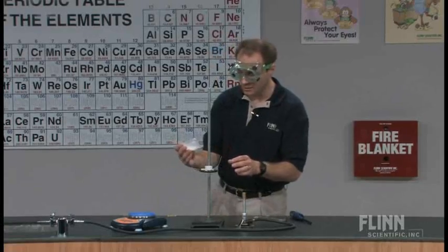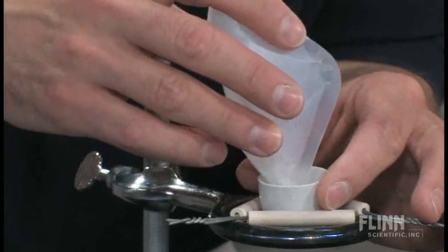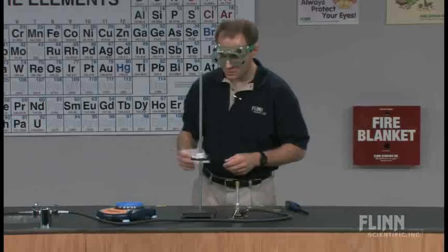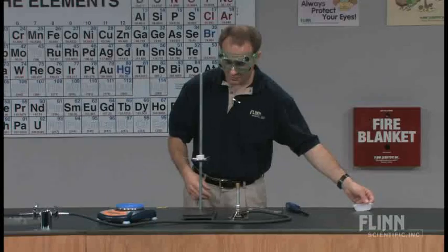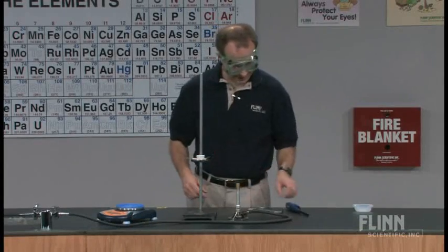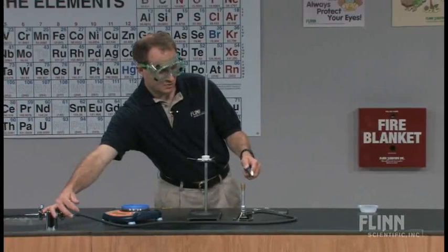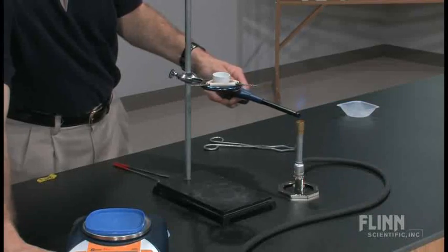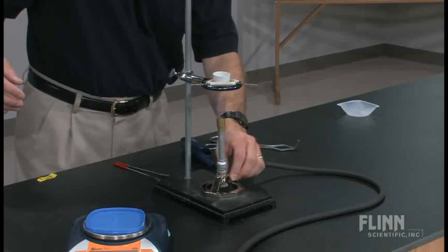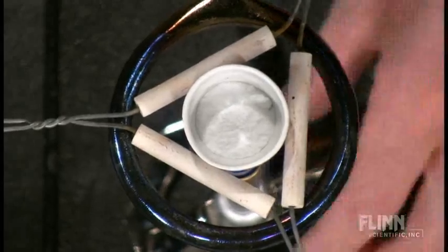I have already weighed that out here, and I'll put that in the crucible. So that goes inside the crucible, and now we'll heat the sodium bicarbonate up and we'll get that reaction to occur. It only takes a few minutes.